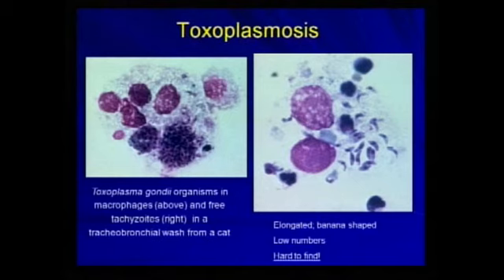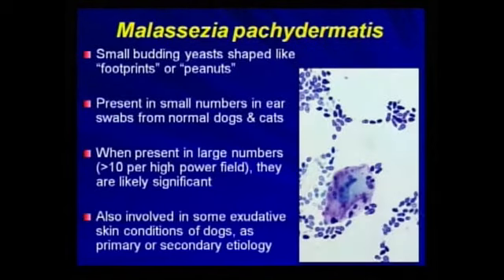They do get a very profound interstitial pneumonia, which is necrotizing, and with transtracheal washes, you can very rarely see these toxoplasma schizonts. There's an intact one on the left, and the one on the right is ruptured. Notice how the macrophage is containing it. Also, there are a number of neutrophils in the field, and you can see the banana-shaped zoites with a nucleus, generally at the tail end of these. But this would be a very uncommon thing to see, if you're lucky enough.